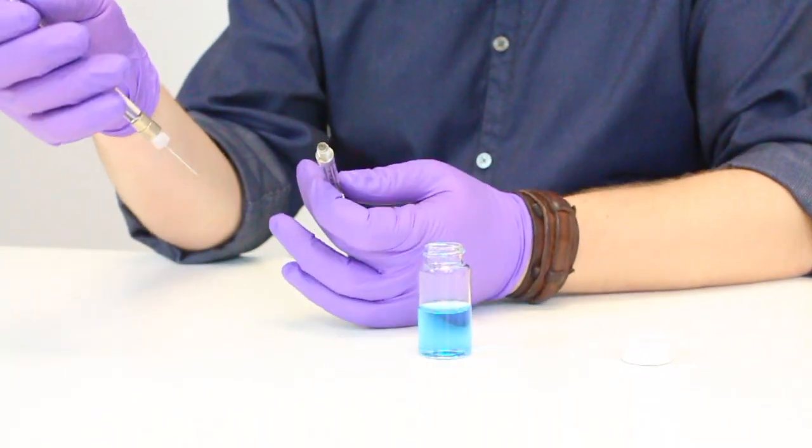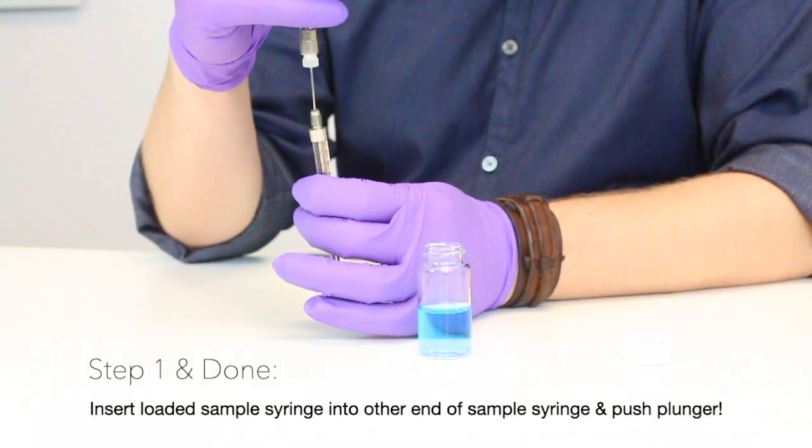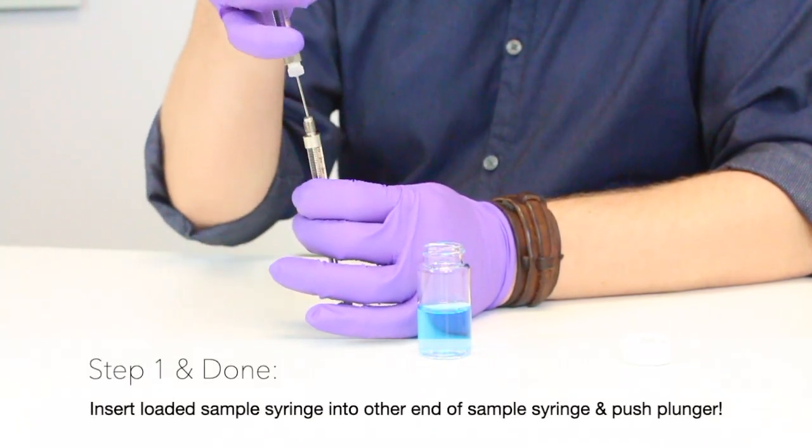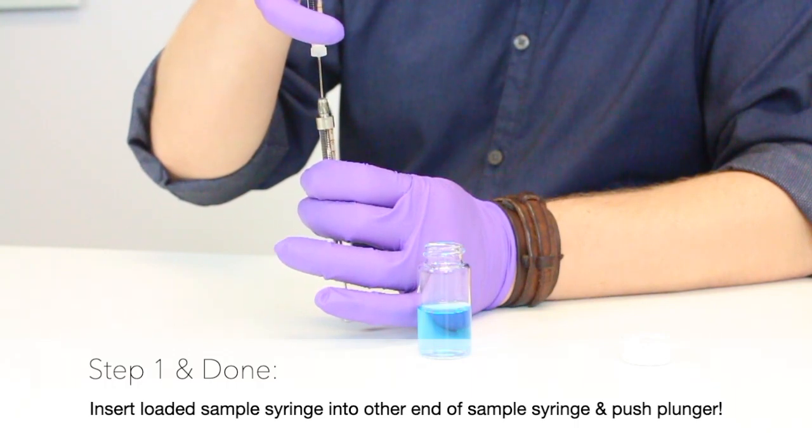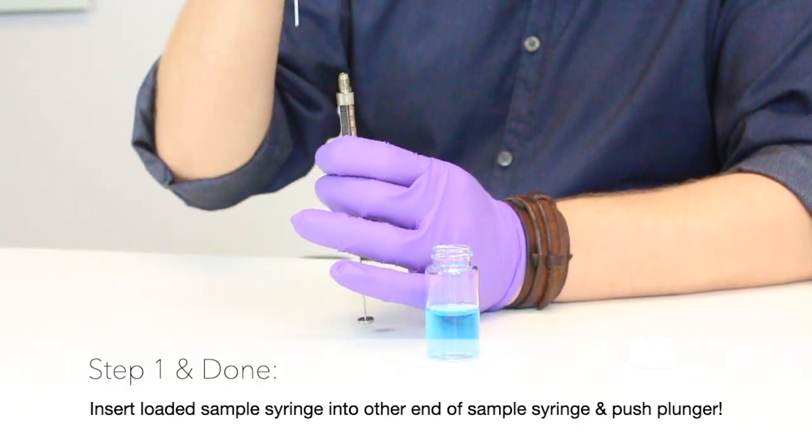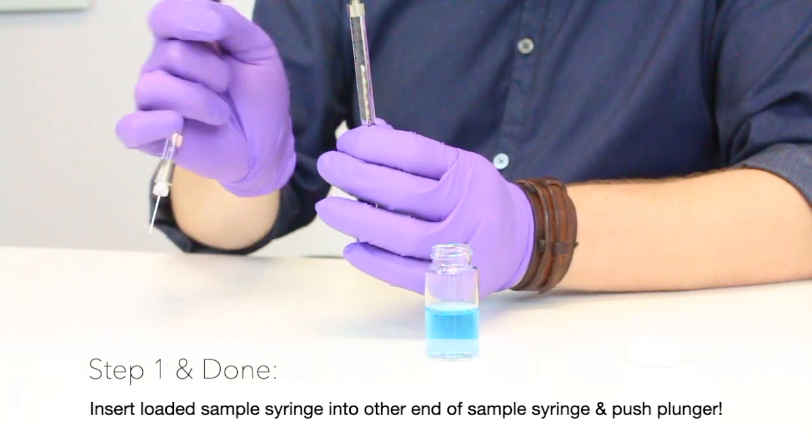Now to load it bubble free I just take this, place it in the other end of the sample syringe, press the plunger, and the sample transfers bubble free.